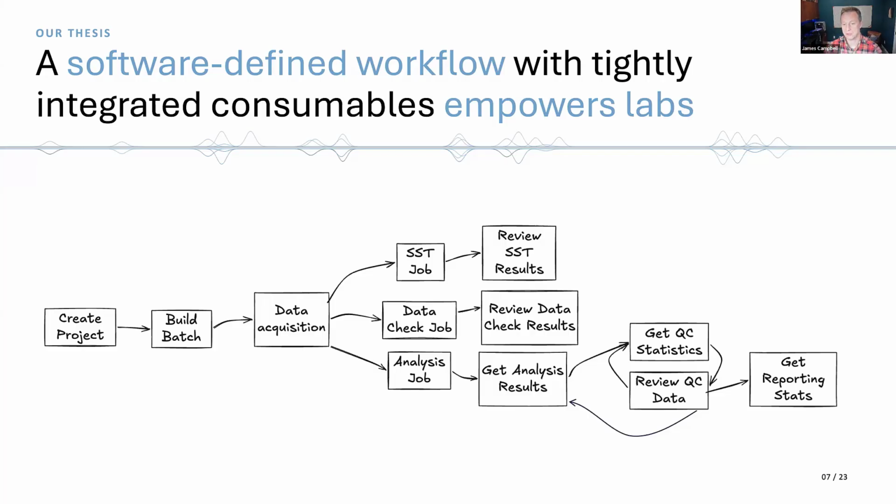For us, I would draw your attention to this bottom right portion here, where there are a couple of feedback loops, and there's feedback between SST and data check as well that I'll talk about. But being able to have feedback loops that are dynamic is really a hallmark of what it means to have a software-defined workflow.